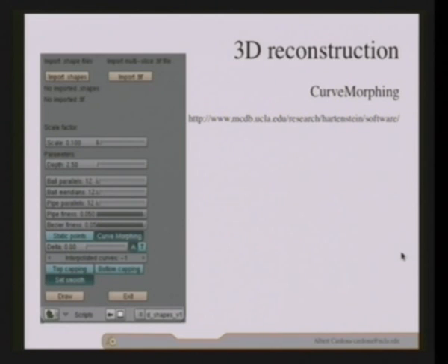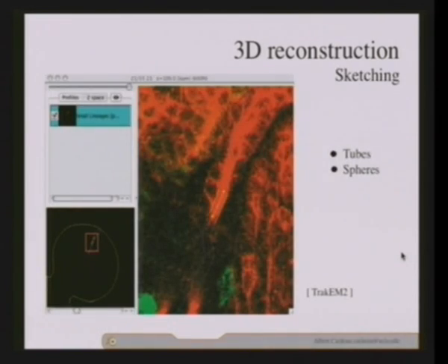And so, let's move on. So much for now for meshing, which already solves part of my problem. I can just do manual outlines on my stack of images and get the mesh. But then sometimes this is so slow that it's not worth it.